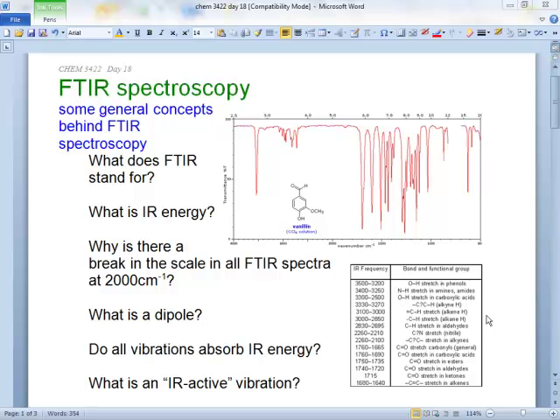I think if you synthesize something, right? And I'd say this is more for a research kind of thing. First, you're synthesizing something, think of it really big, so that rules out the GC, right? And then if you wanted a quick answer for something, the HPLC is not going to tell you whether a particular bond's there or not, assuming you just have the diode array detector, like a UV-vis hanging on the end of it. Forget the AA. The NMR might help you out if the FTIR can't get it.